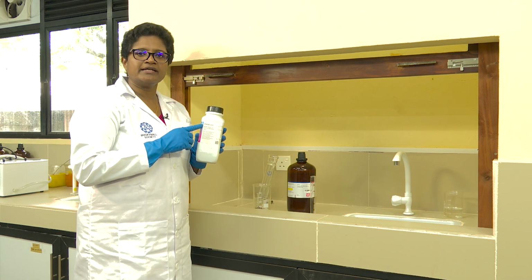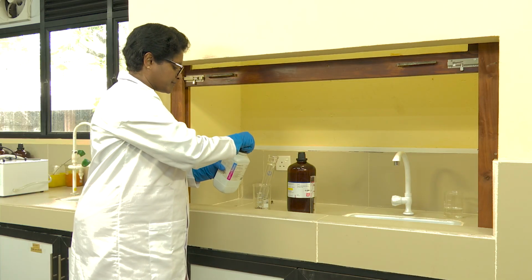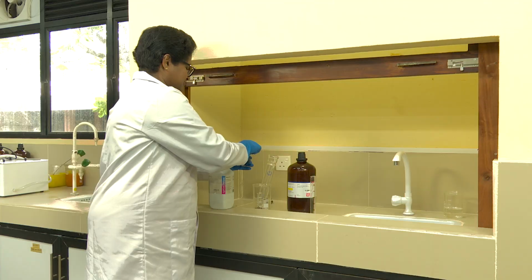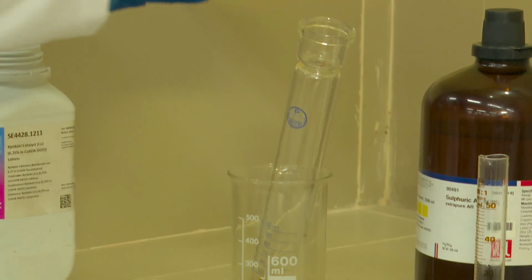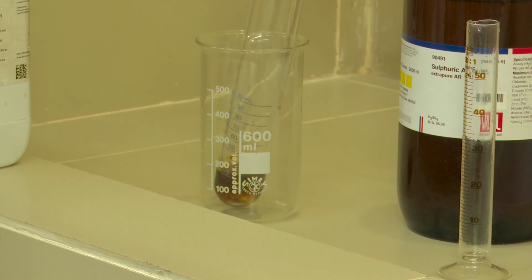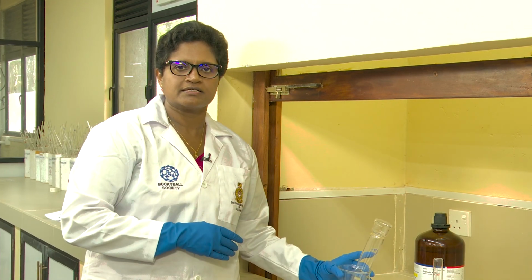Next you have to add 2 Kjeldahl catalyst tablets into the same digestion flask. Next you have to place the digestion tube in the block digester for the digestion process.